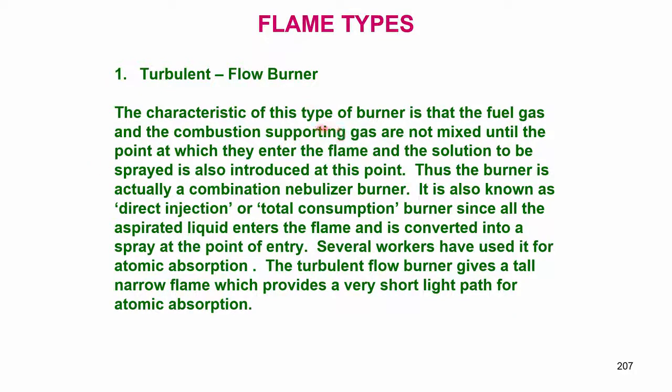The characteristic of the turbulent flow burner is that fuel gas and combustion supporting gas are not mixed until the point at which they enter the flame, and the solution to be sprayed is also introduced at this point. Thus, the burner is actually a combination of nebulizer cum burner.